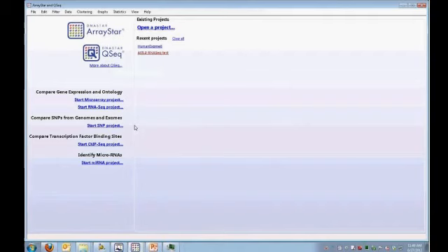And just quickly, I know we only have about 10 minutes left, but how does our software compare to other freely available software for de novo and templated assemblies?